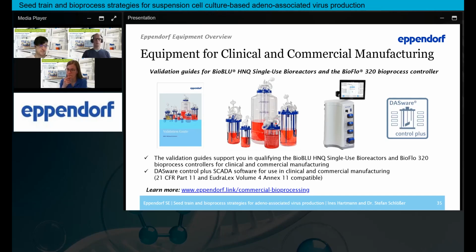The handling here is just easier. Plus, if you have a long process, there's also less contamination risk. You have to guarantee that they are sterile during delivery, right? Exactly. You can just run your process with a calmer mind, I would say.